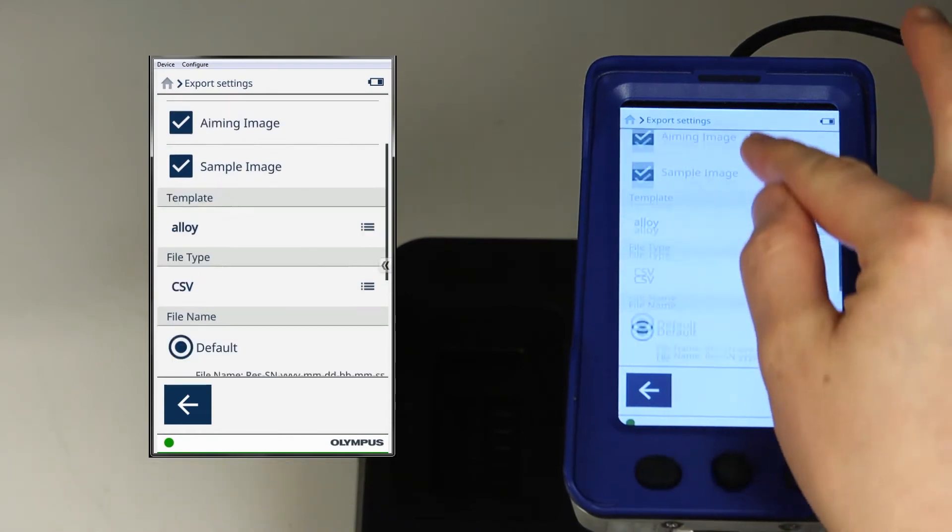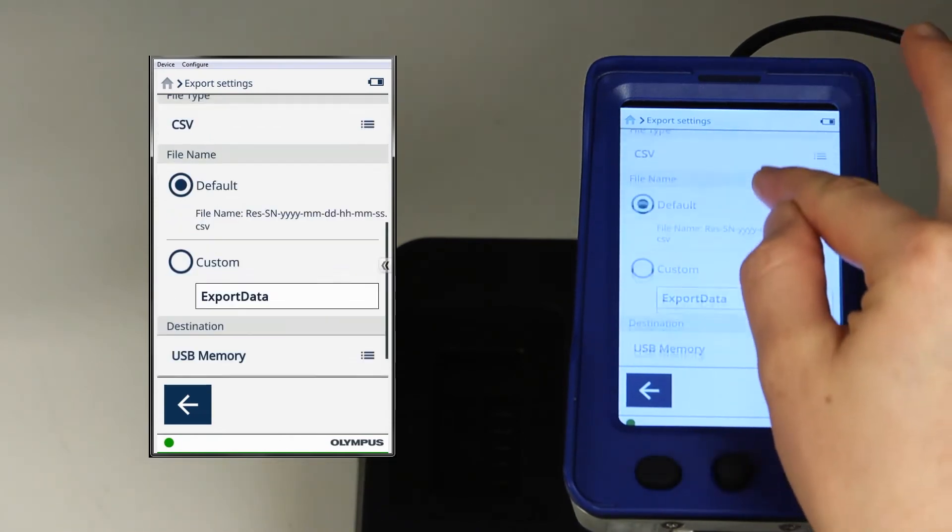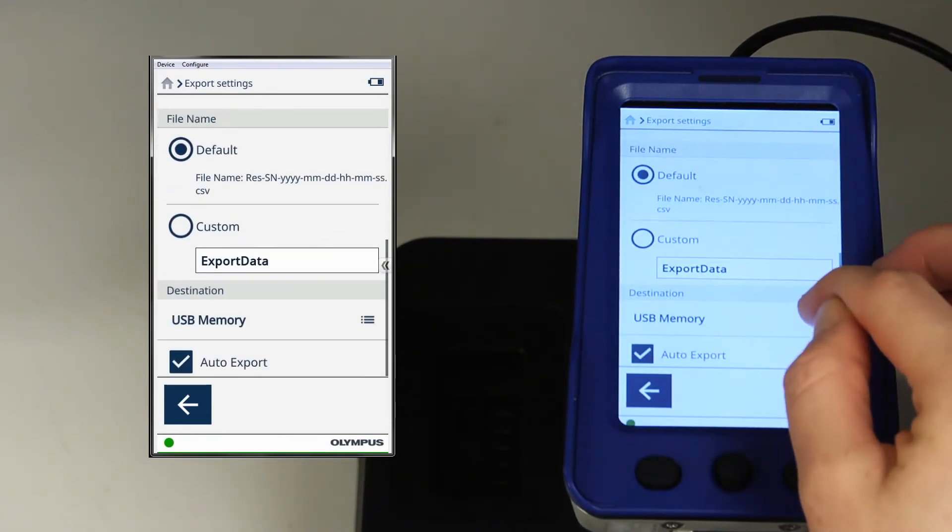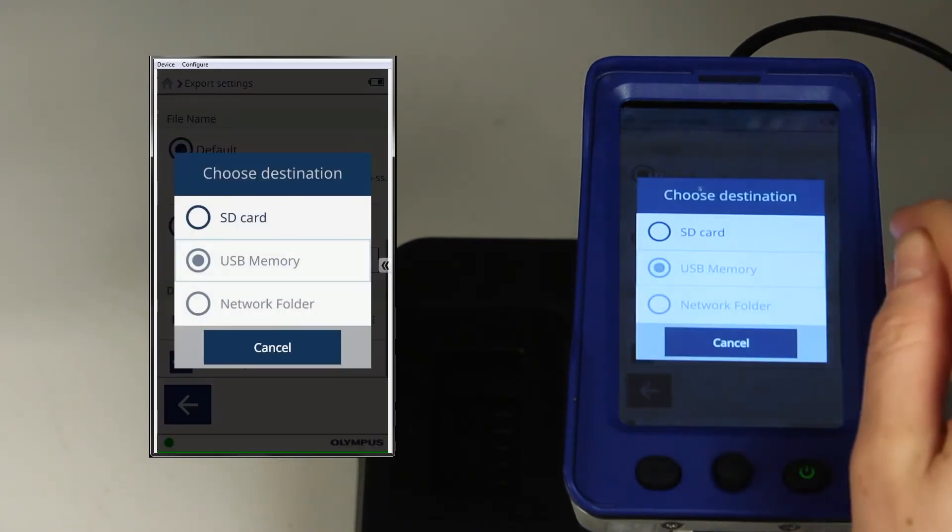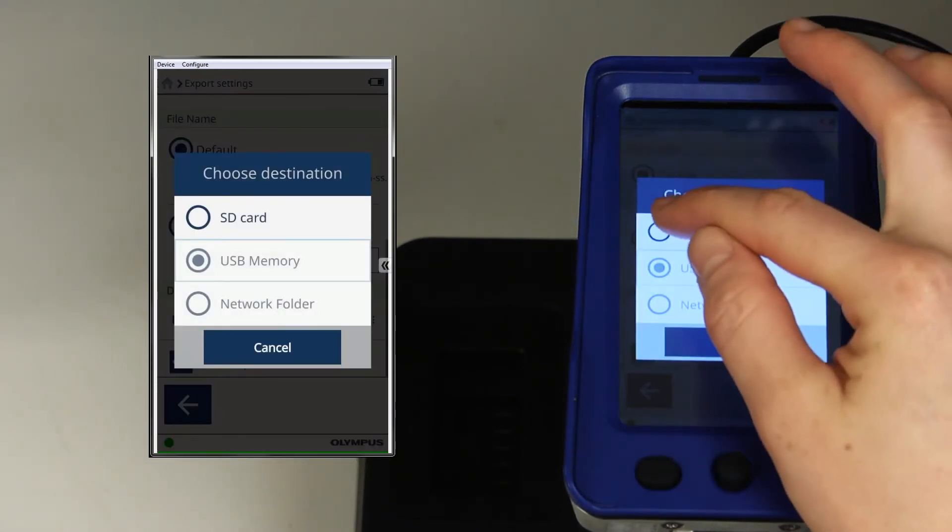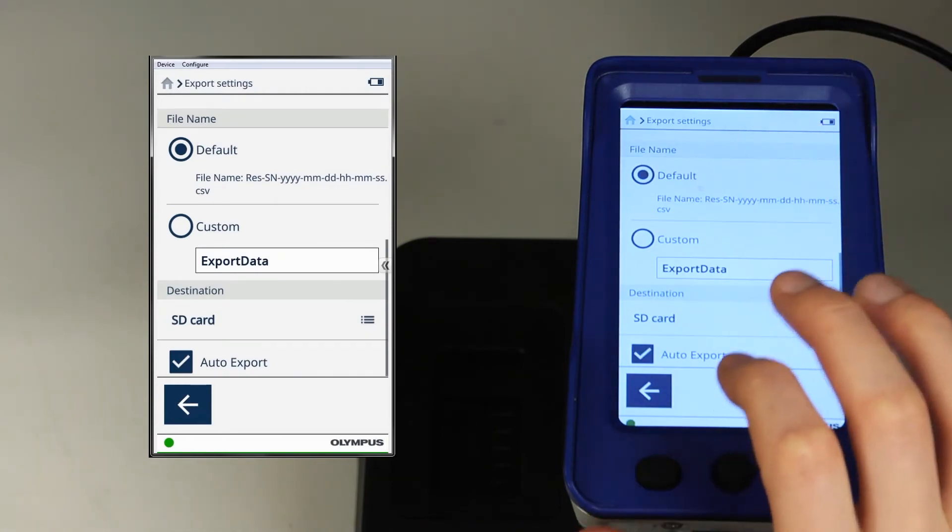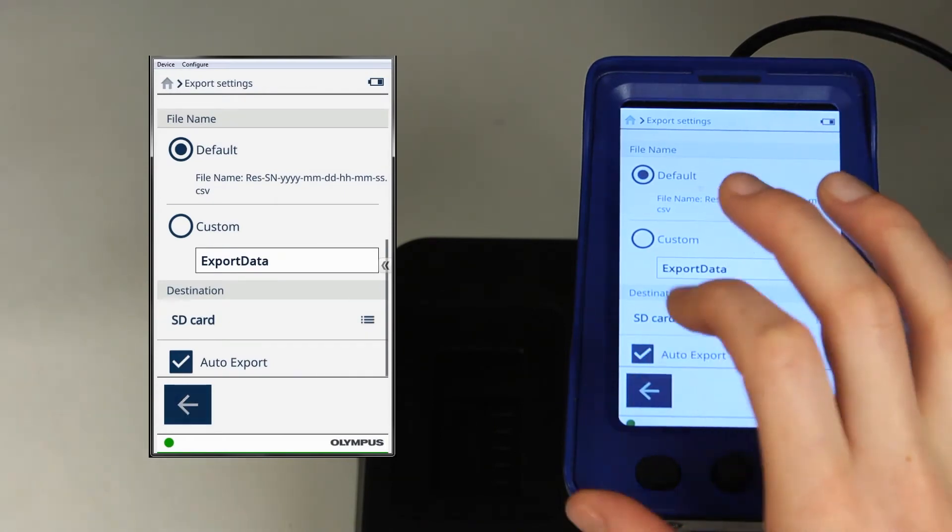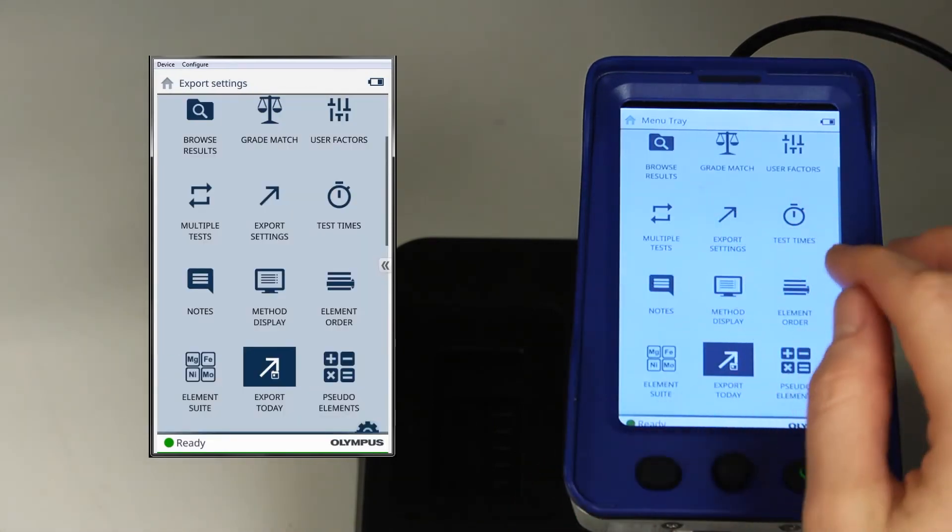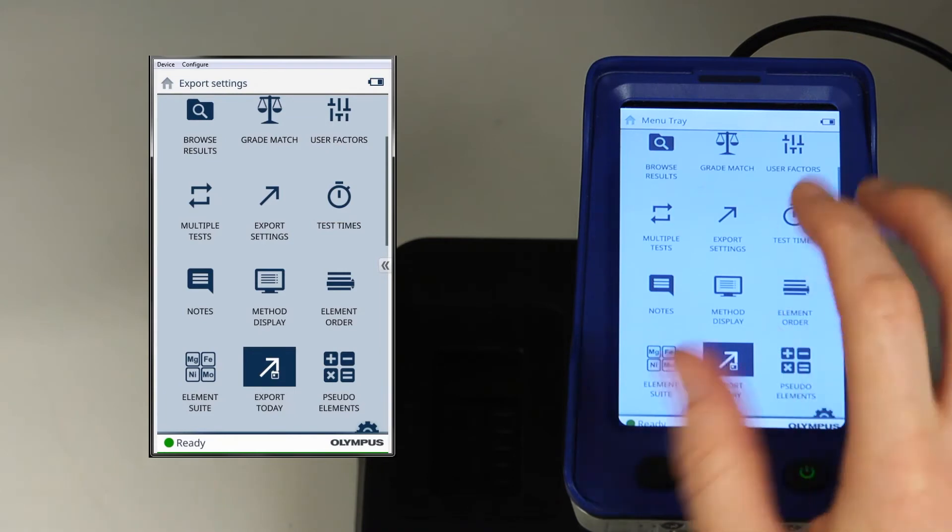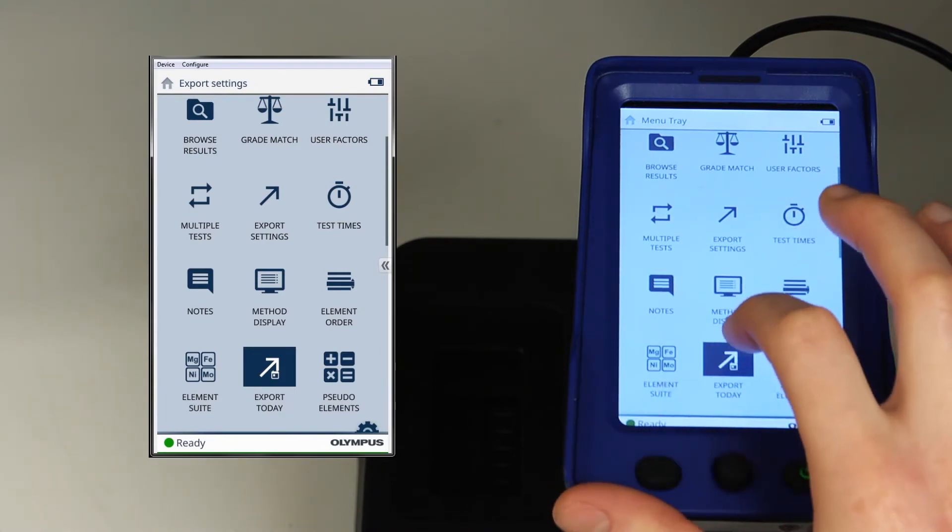I'm going to go to destination SD card. Now I'll export today.